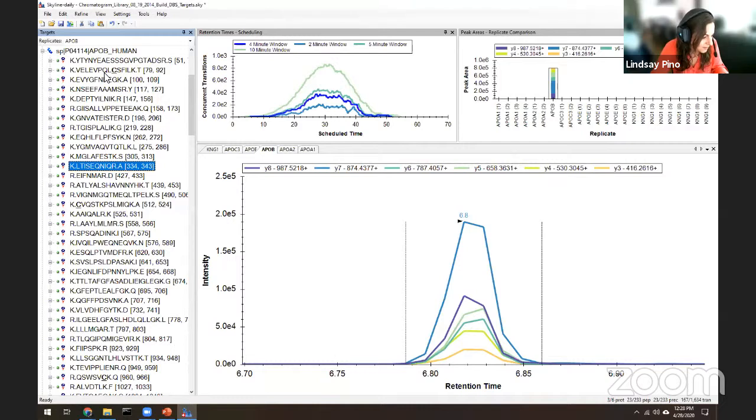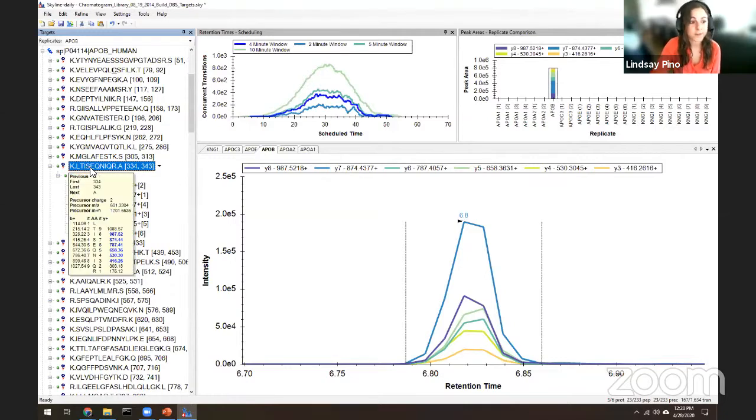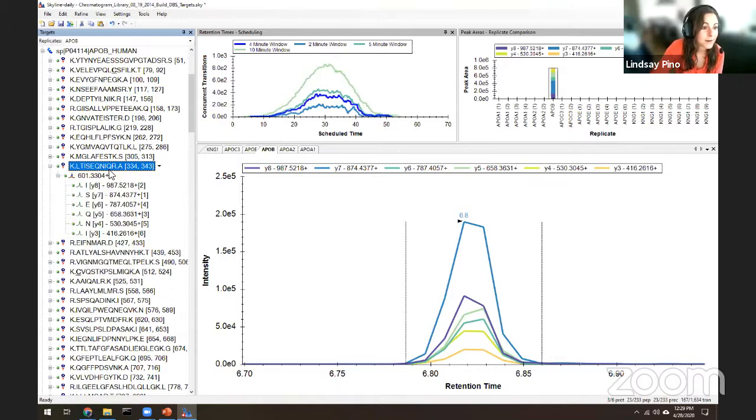Does it make sense to survey for an interesting peptide considering different precursor charges and or potential PTMs? Is it better to survey for very specific precursors? If what you mean by interesting peptide is that there's a lot of PTM sites on that peptide, you might want to consider different precursor charges for that peptide sequence. But to be clear, when you're choosing a precursor, for example, if this peptide sequence that I have here now, if we imagine the serine at position 4 could be phosphorylated and some other strange modification can happen on this peptide as well.